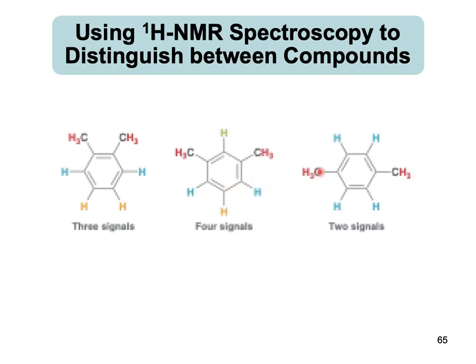How many in this case? 1, 2, right? All four protons have the same chemical environment, that's why there are two signals. This one is 4 and this one is 3 because of the identical chemical environment in these protons and identical in this one.